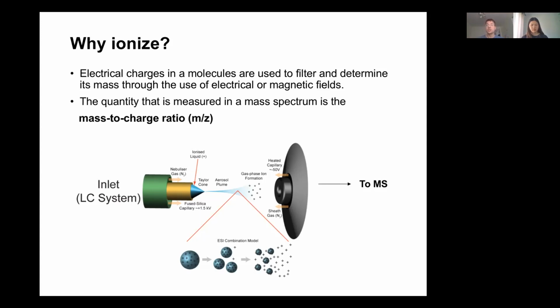Because you can imagine if you have something massive, and in a technique like MALDI, which shoots a laser at a solid matrix to create ions, that'll only generate singly charged ions. But if you have something massive, since the mass spec is measuring the mass over the charge, it's beneficial to have something that's highly charged, because then your mass to charge will fall into a window that actually is visible to the mass spec. I think that's all I want to say there.